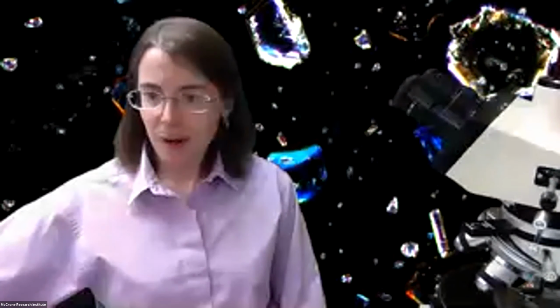Someone asked about removing the blue filter on your microscope. I have found that that can be helpful. What actually can be really helpful also is closing your field diaphragm a little. Ordinarily, of course, we close the condenser aperture down, but sometimes closing the field diaphragm down a little bit can be helpful as well.